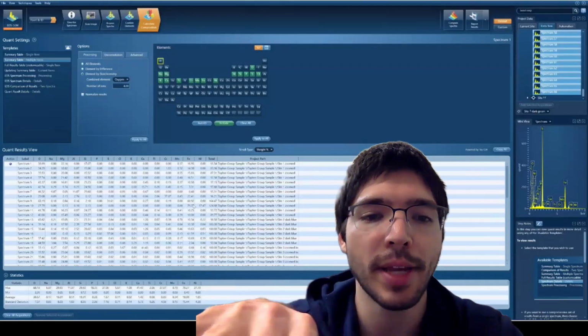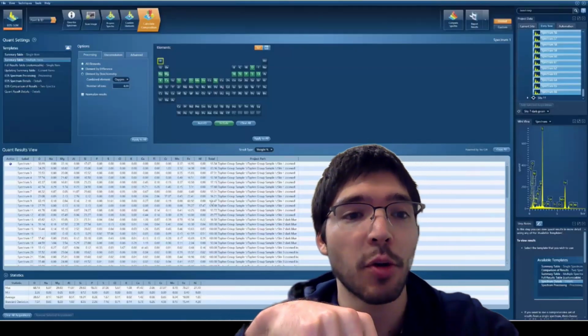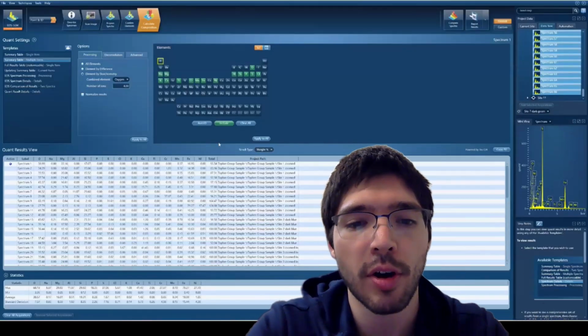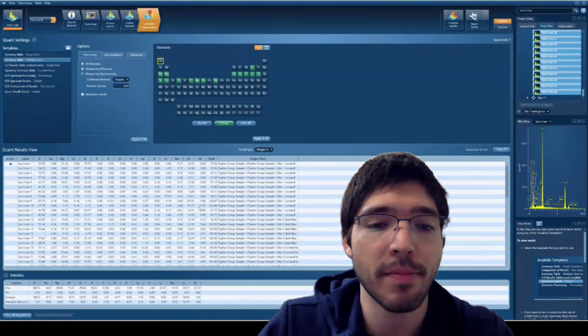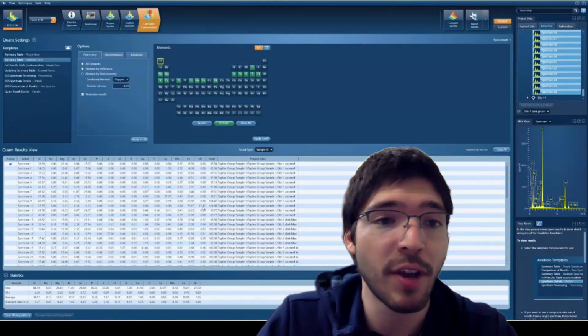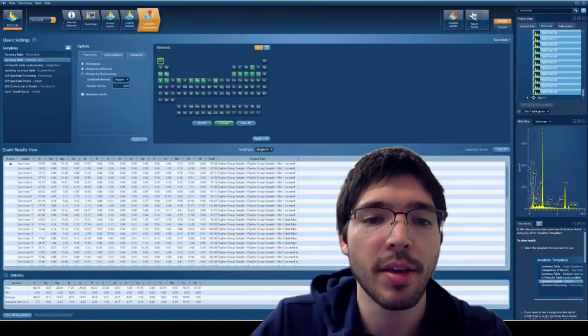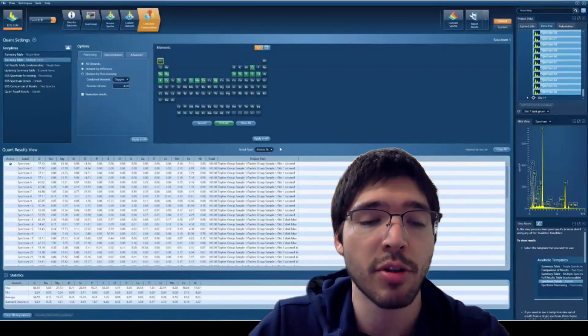So whenever you zoomed in, everything was a little blurry, and you had to rely on going to a nice area to get a data point from. With the SEM, you can go down to almost tens of nanometers, very small objects, and you can get pretty crisp images of them. So for geological needs, getting things at the micrometer scale is very easy to get nice images of.